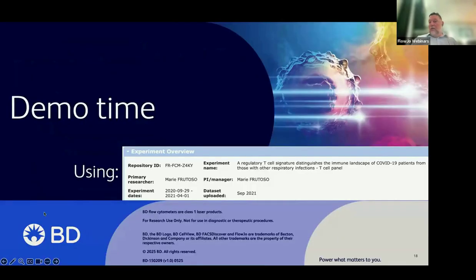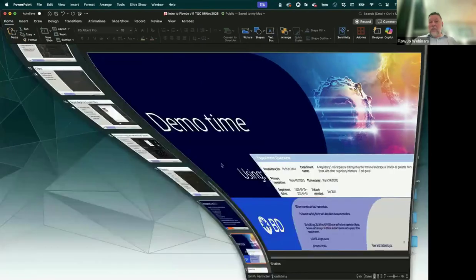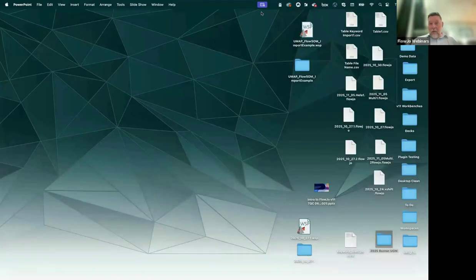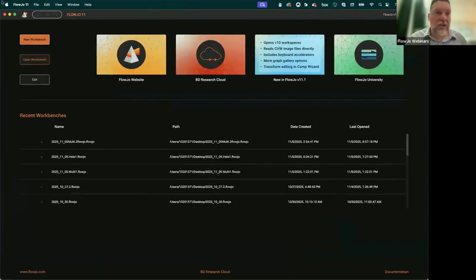So that's my spiel on the deck. And now I'm going to go in and I'm going to launch V11 and we're going to look at it together. So feel free to pipe up in the chat if you have questions specifically, but what I'm going to do is just bring up the application.